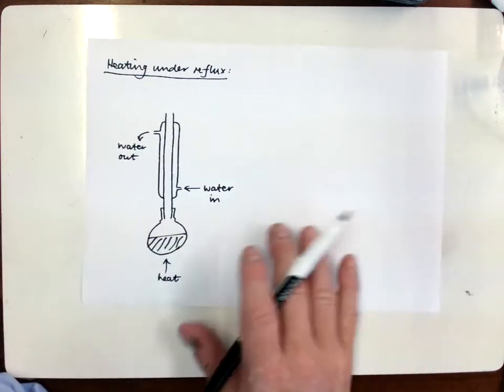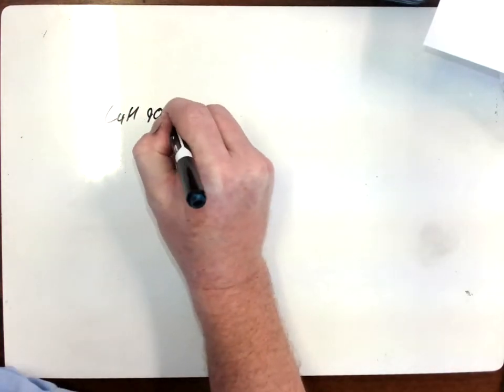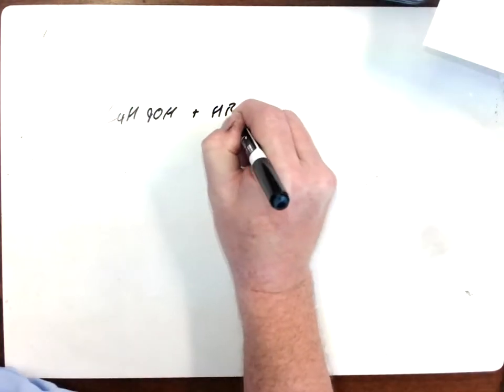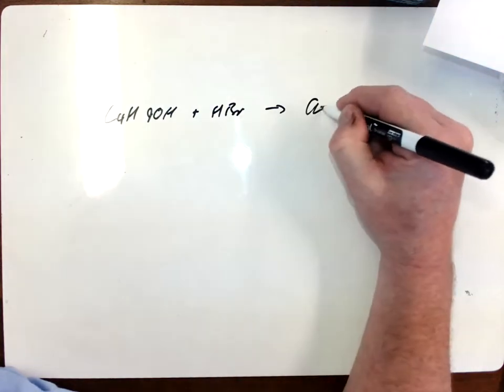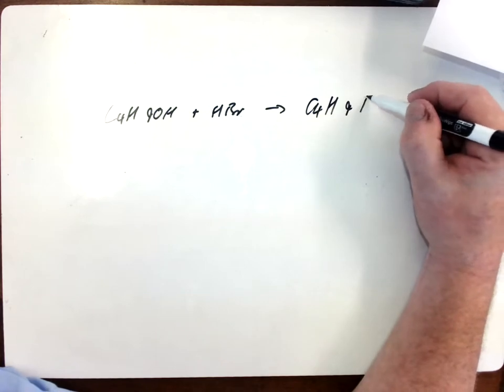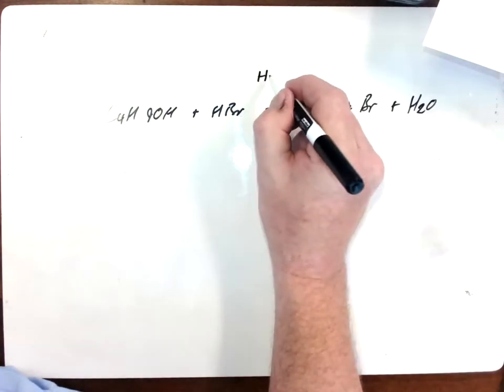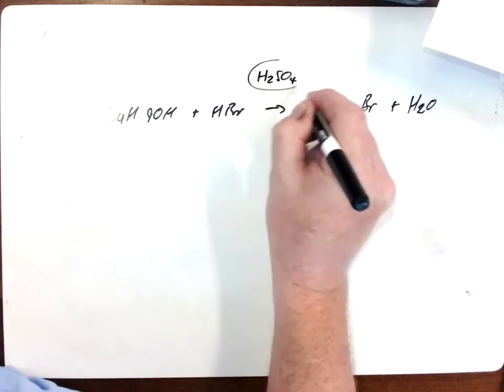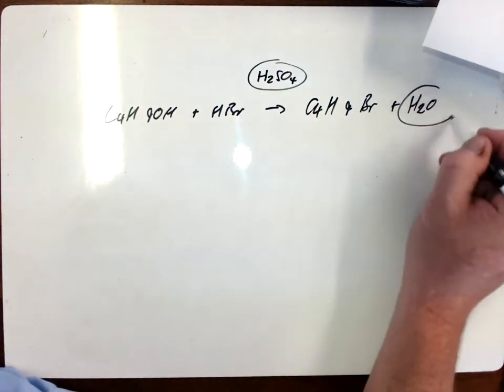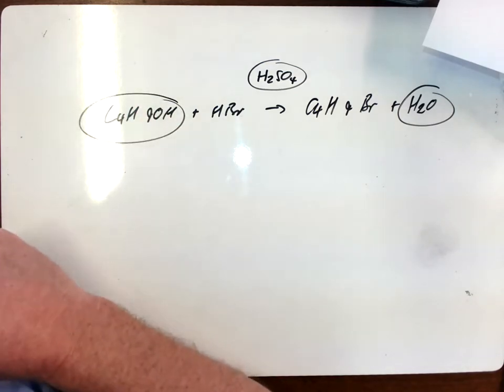And at the end of that, you'll have what we call a crude product. So if I go back to here, some of my 1-butan-1-ol will have reacted with HBr, and I will have this. I will also have left over some unreacted sulfuric acid. I will have some water in there. I will still have some unreacted alcohol.